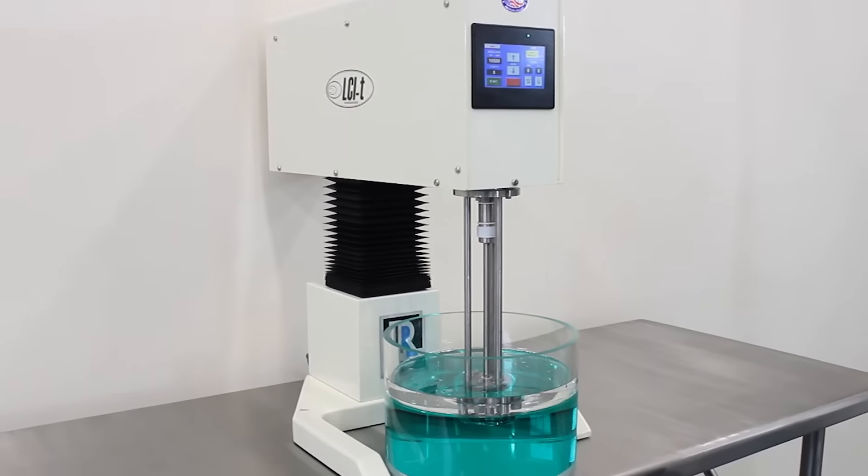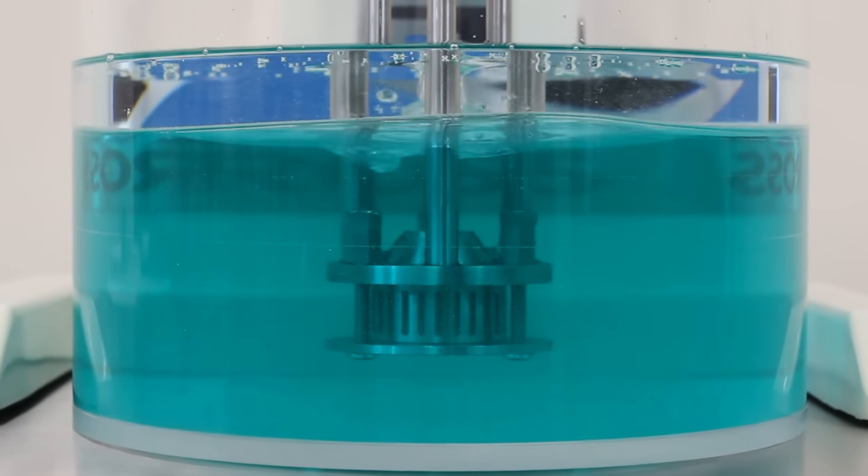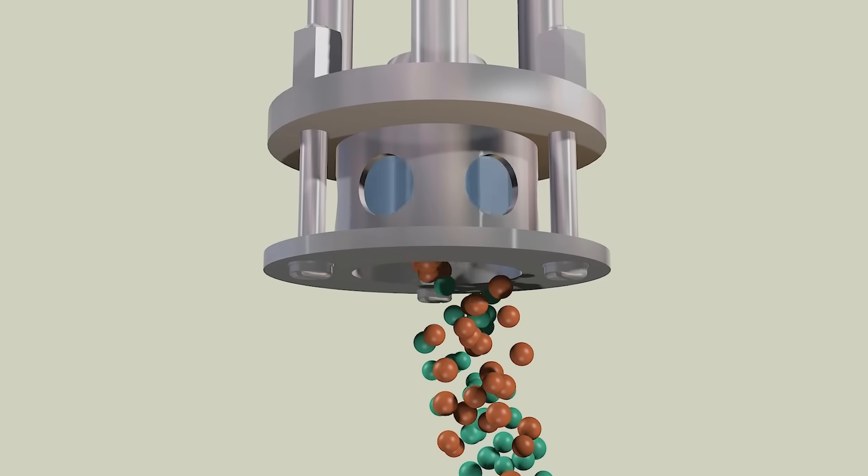The High Sheer Mixing Assembly utilizes a high-speed rotor turning within precision tolerances of a fixed stator, creating a mechanism of unprecedented mechanical shearing and milling.